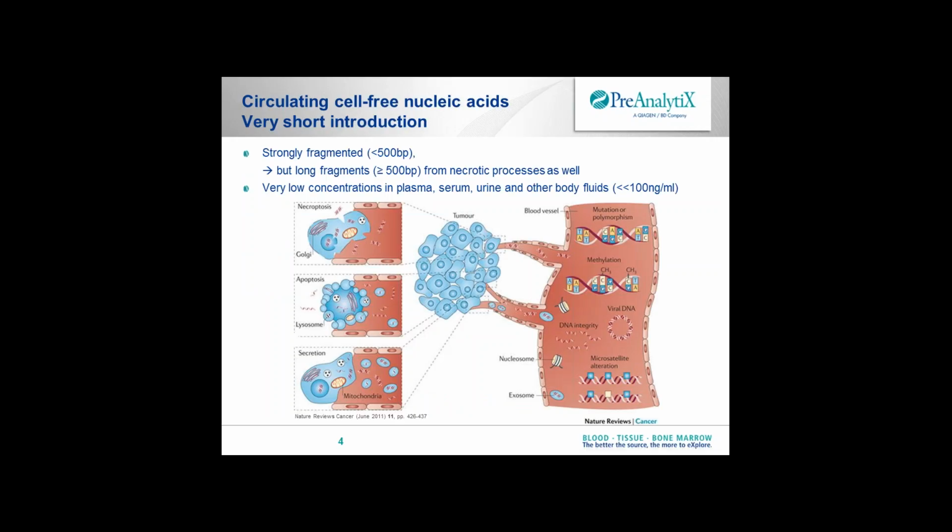So starting with the introduction, I chose this nice picture from the Nature Reviews article from Schwarzenbach et al. that shows what ccfDNA in blood is all about, and I think nearly all of you know this. But I just want to highlight some special features of the ccfDNA from body fluid that are important for the stabilization features that I present in a minute, but also for the isolation with the QIAsymphony in the last slide.